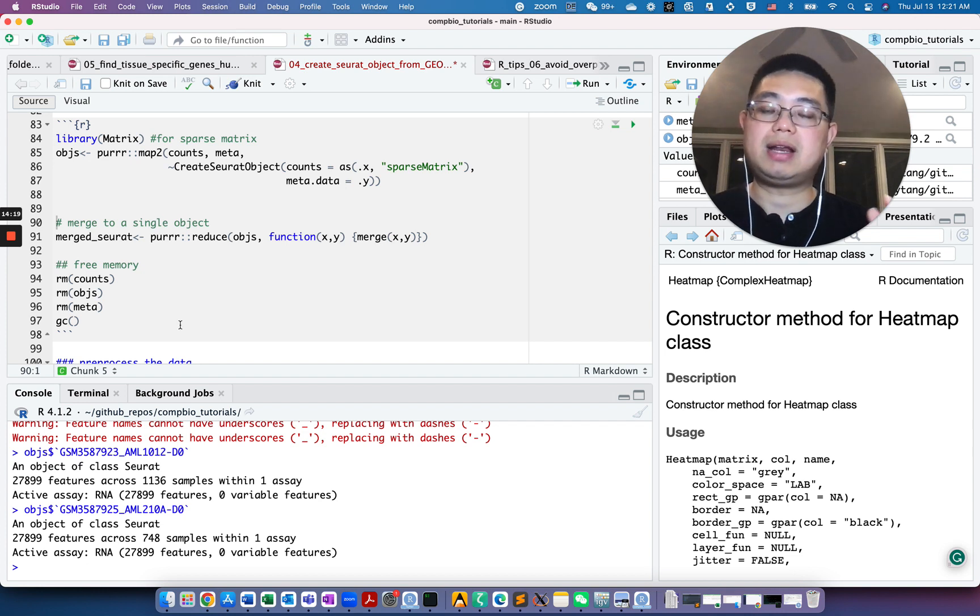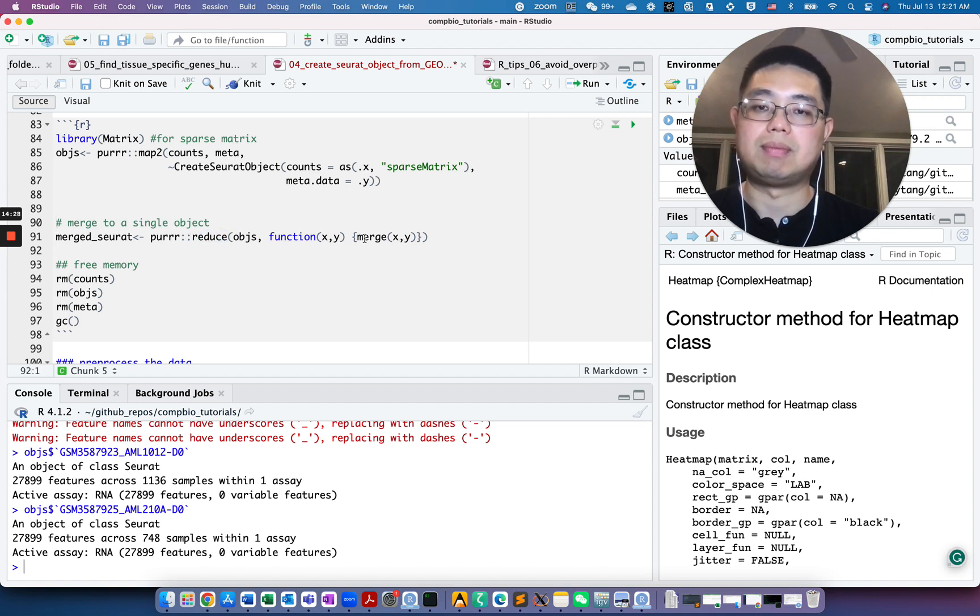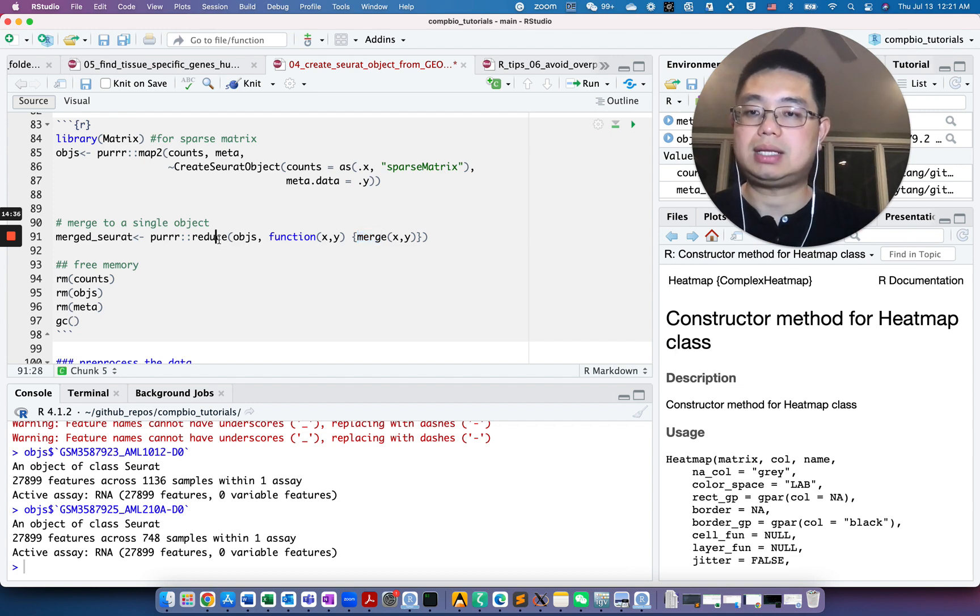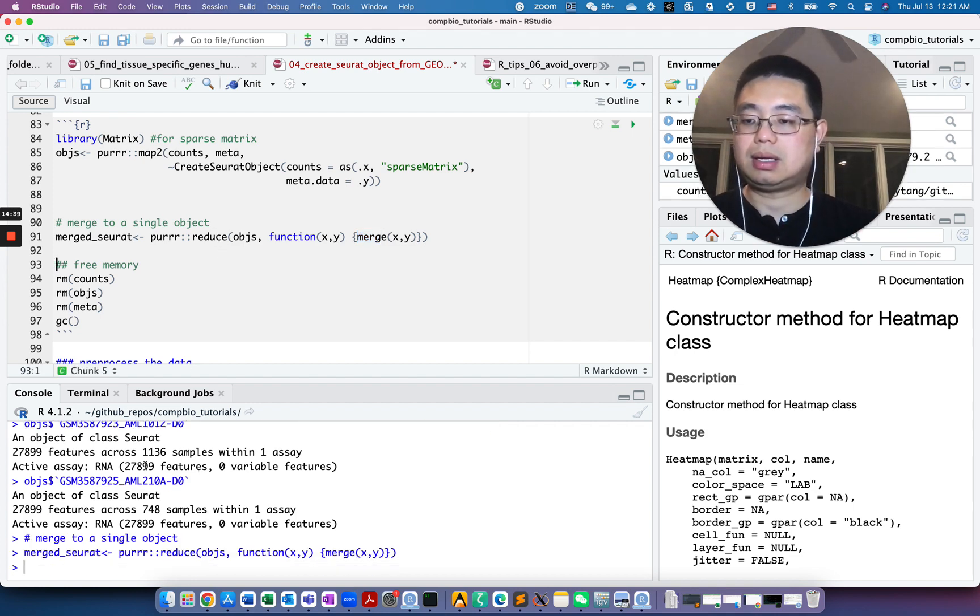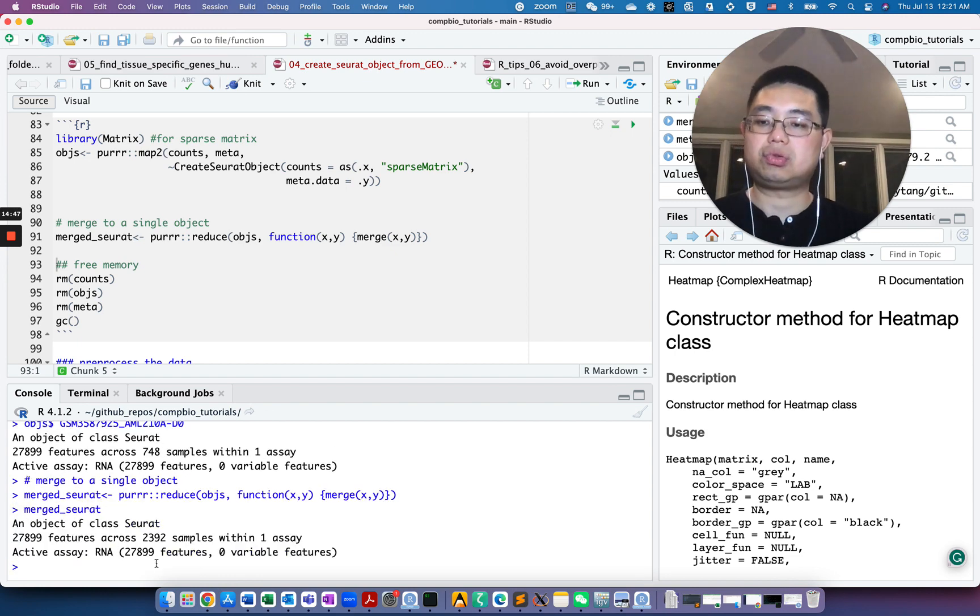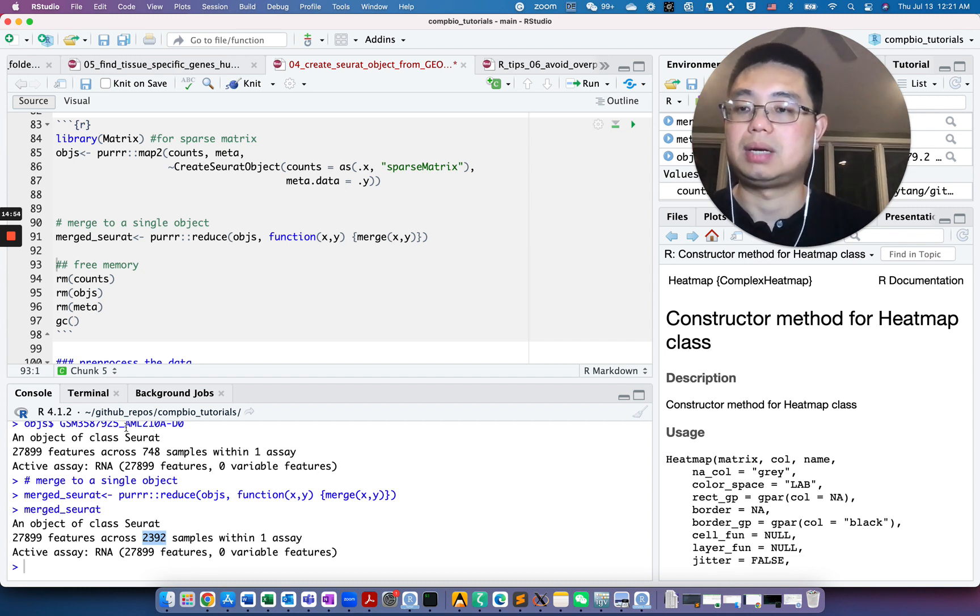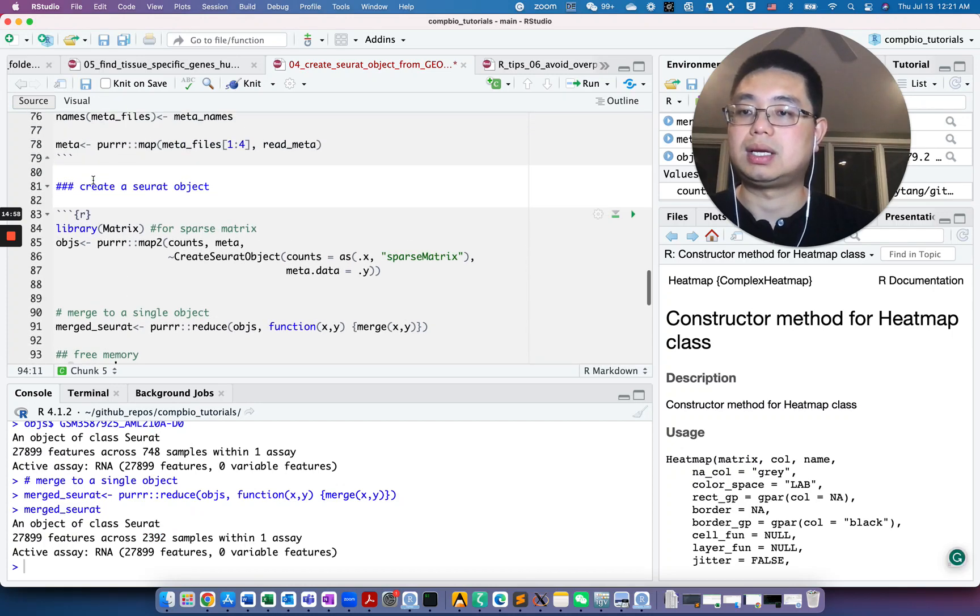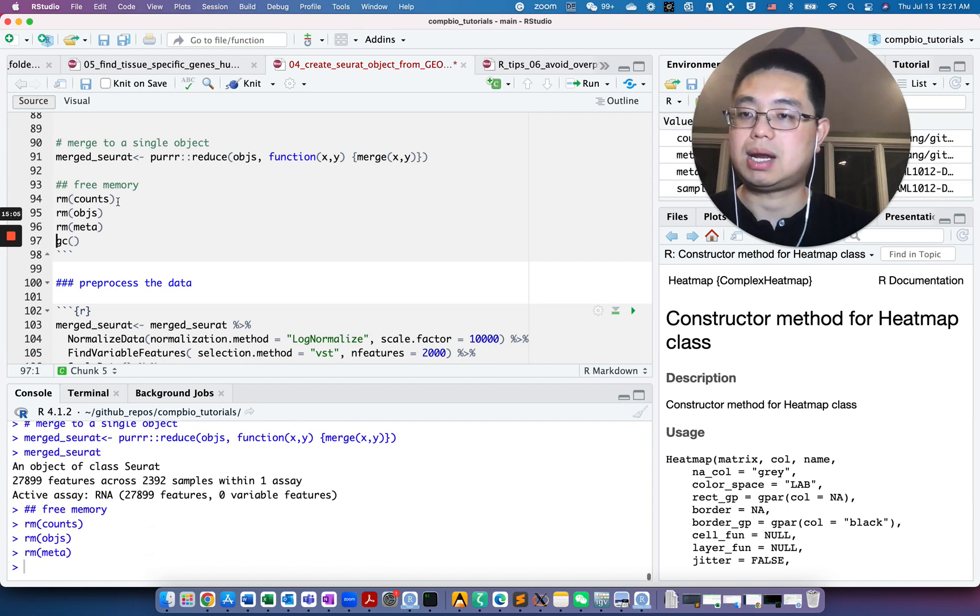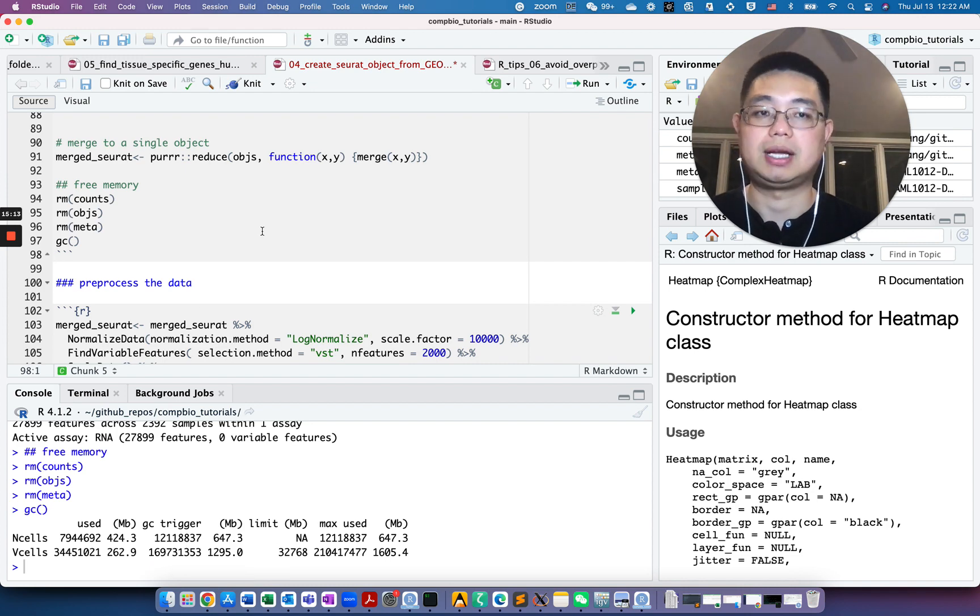Now we are ready to merge all Seurat objects together. To do this, we can use the reduce function from purrr and we can merge x and y. So merge these four Seurat objects iteratively. Now if we look at here again, merged_seurat, now it's a single Seurat object, but now we have 2,392 because we merged all the cells together into a single object. Now we can remove those big files to save memory, those counts, objects, meta, and then do garbage collection to reclaim all the memories.